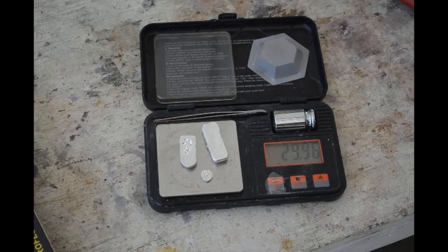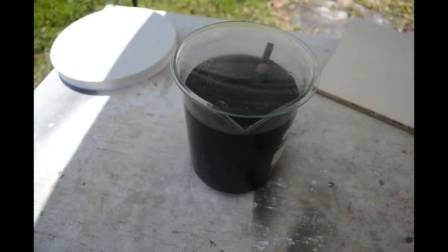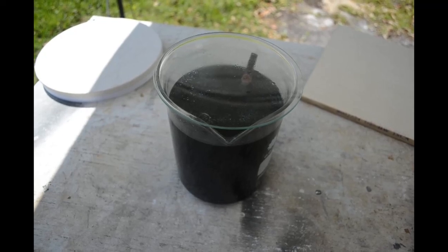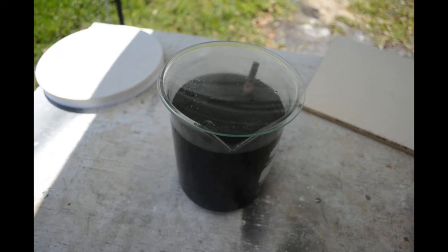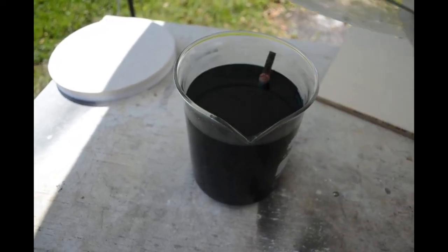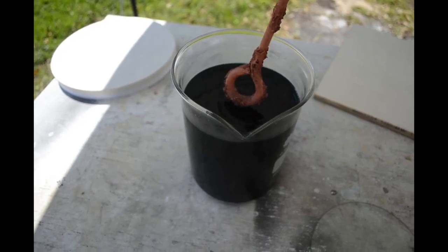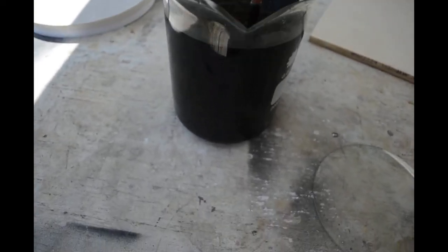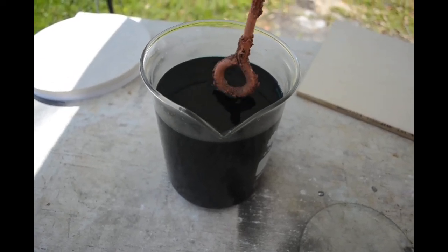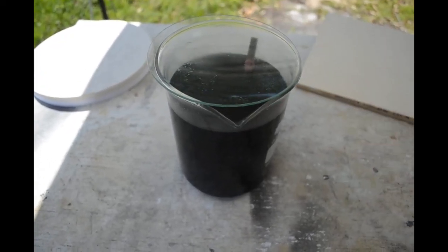I've got one more little thing to show you before we wrap up. There's always somebody in my comments when I'm recovering gold or silver who says, 'What about the copper? You're throwing away a lot of copper. That stuff's valuable.' Well here's what you do: take your depleted solution after you get all the silver out of it and just throw some scrap iron or scrap steel in there. Same cementation process again — the copper will cement out on the iron or steel. There's already a lot of copper down on the bottom of this beaker that's cemented out. So that's how you get your copper back — nice, clean, pure copper recovered from your waste solution.